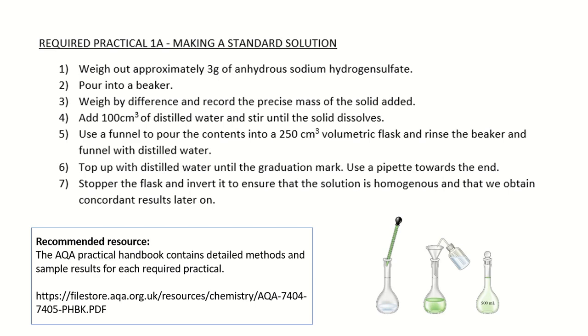So, first thing I'd always do is go to the AQA practical handbook. There you'll find a method for every single required practical. You might also find some sample results and general notes and advice about the practical. I find this very useful because it gives me the complete method. However, this is a very long method, so what I used to do is copy and paste that into a Word document and cut out all the bits that aren't as important. That way I can just have the important steps and it's easier for me to memorize this for an exam.